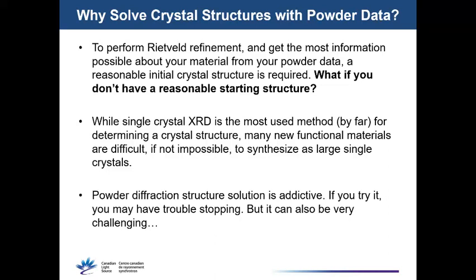Bob mentioned that in solution you could go even smaller. Did you mention this morning that you could get away with 5 micron size crystals in solution? For single crystal? Maybe. I guess the only thing is that those folks doing single crystal diffraction, one crystal at a time at those extreme light sources, those crystals are on the order of about 2 microns.